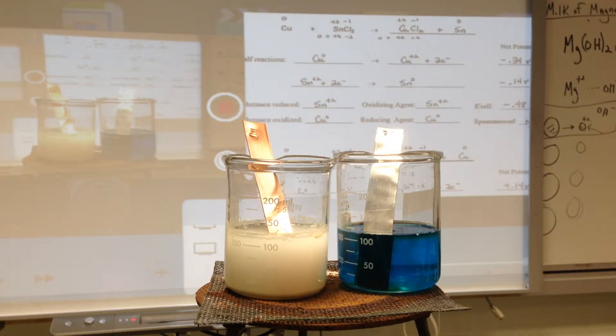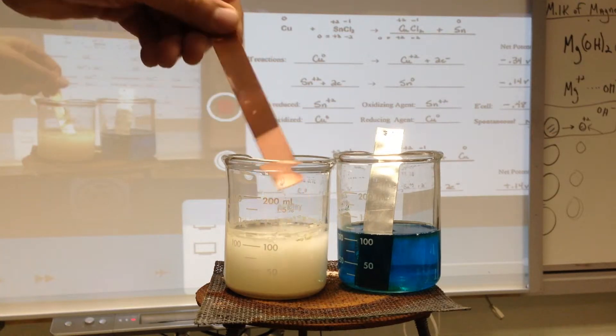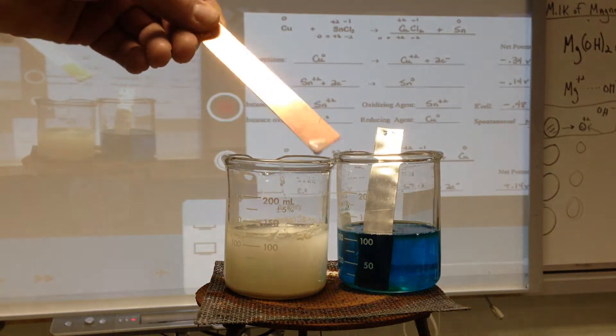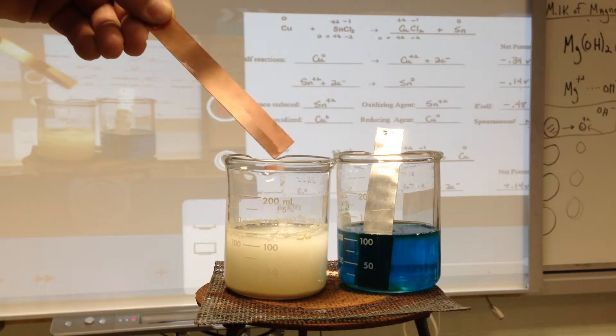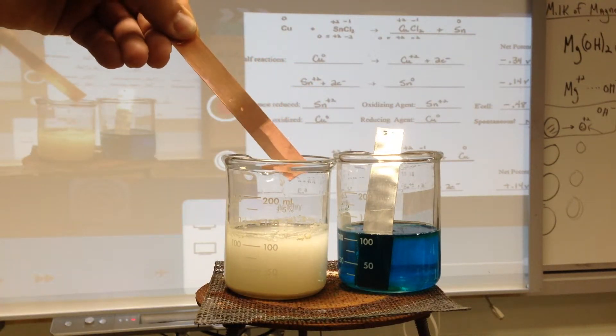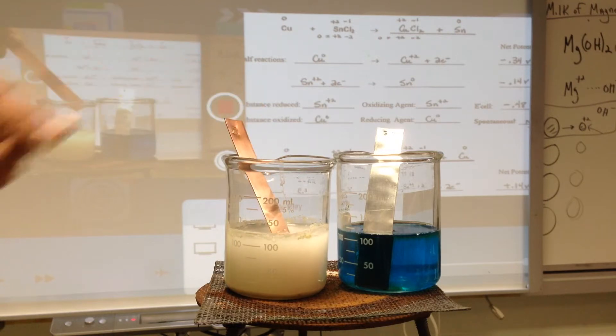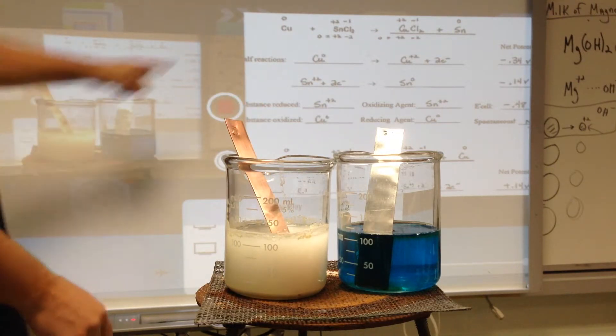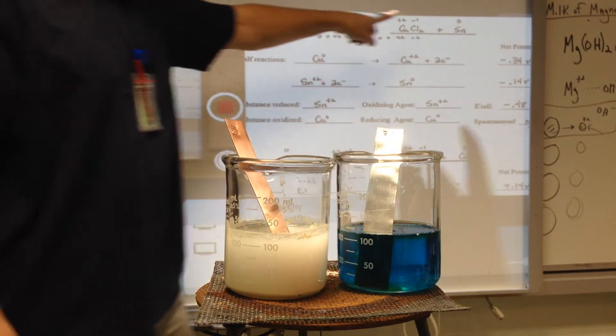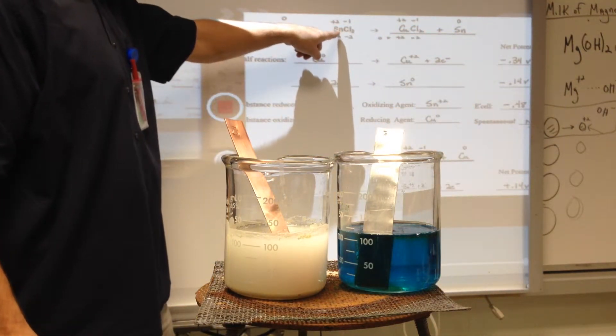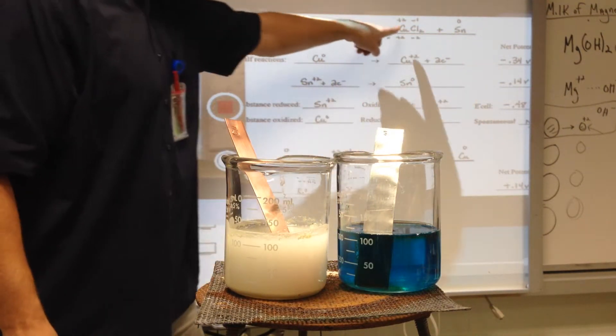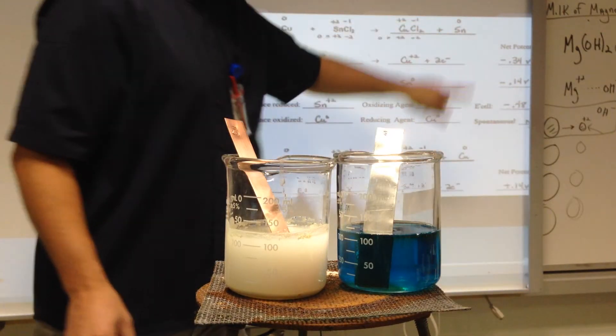There will be no redox reaction here. If I take this out, you'll see that all I have is a milky solution on the copper. There was no redox reaction, because if you look at the half reactions or the overall reaction, you would suspect that the copper would be plated with tin, as we would replace the tin plus two with the copper plus two and kick out the pure tin.